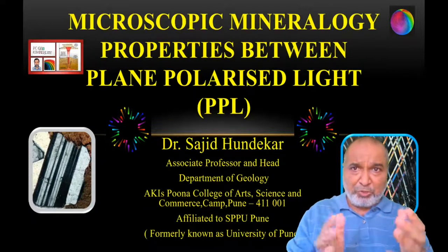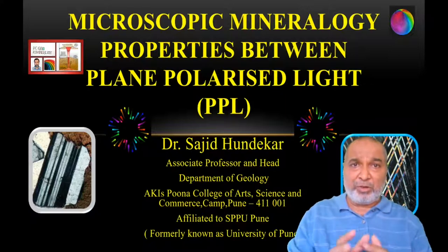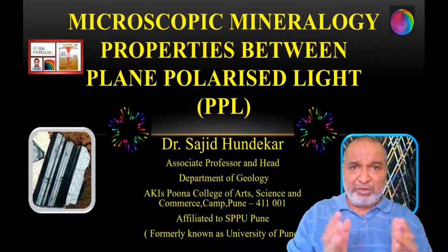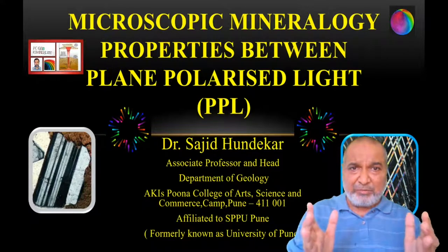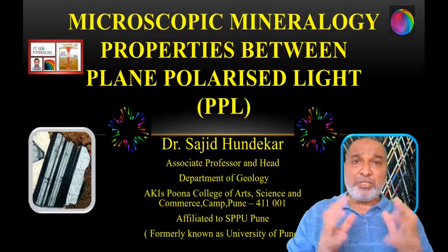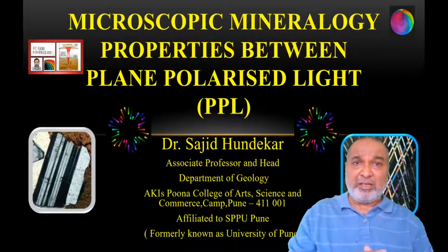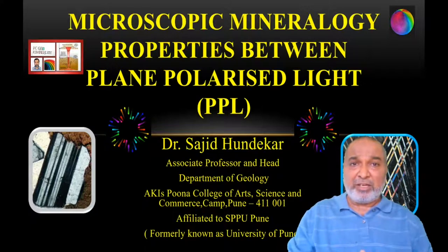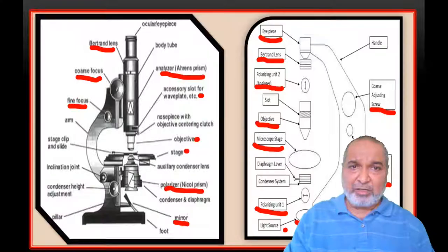So before going to the topic, we'll have a discussion on the petrological microscope, because normally you have handled the biological microscope. Now this is the first time you're going to handle a petrological microscope, so we have to see what additions are there in that particular microscope and how you're going to handle it very carefully. So we'll go to the microscope first.